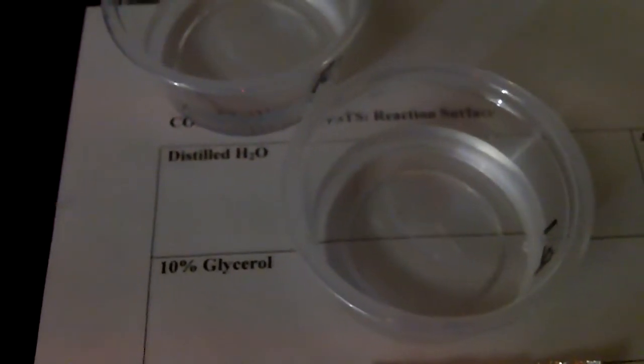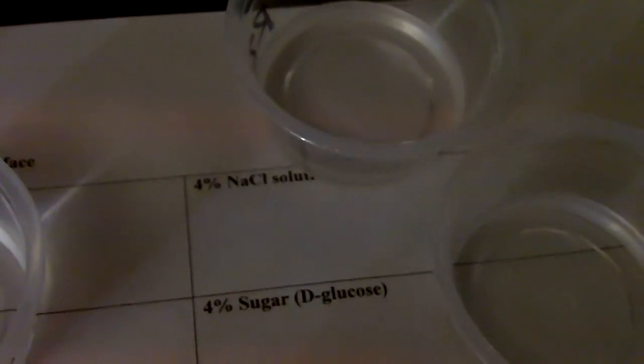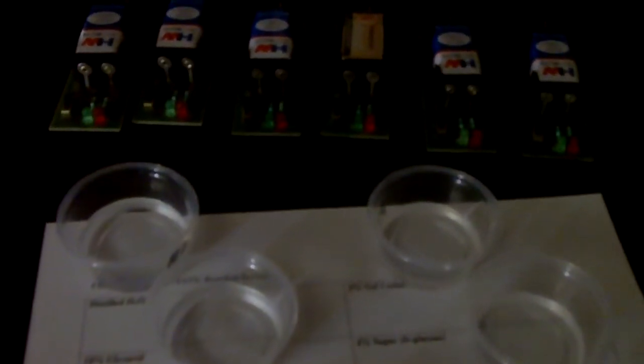We do have laid out here on this small scale sheet the various solutions that we're using, and they do match the order that's presented in the data table. So distilled water, 10% glycerol, aluminum foil, and the unknown substance. And on the right side of your table, you have 4% NaCl solution, 4% sugar, and solid NaCl. Each, and not in drops, but in various sample cups to facilitate the ease of this video. We won't be needing to clean conductivity meters as we have a set of conductivity meters to save some time within the creation of this video.